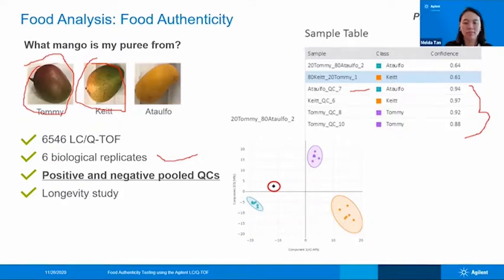But in a GCMS, whatever spectra you're getting from GCMS is a fingerprint. So you can work with a NIST library and then you can identify. It is one of the plus points of a GCMS, so you can still use a GCMS to build this model and follow the same workflow. We recommend Q-TOF, of course, because you have better mass accuracy and better identification, but GCMS also works. However, this is not true for LCMS, because in LCMS, with unit mass resolution, it is difficult to identify anything. Very good question, that one.